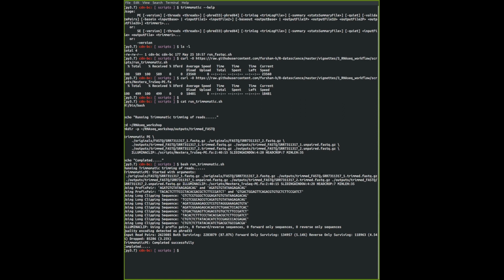If you're not sure where exactly the FastQ files are, you can refer to the contents of the script file to see where the outputs are, and then run the script so that you get a new set of FastQC output.